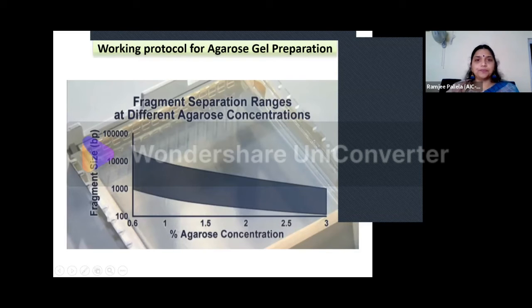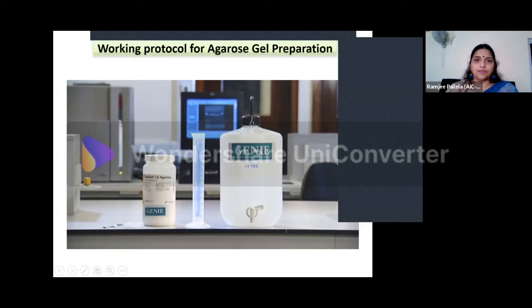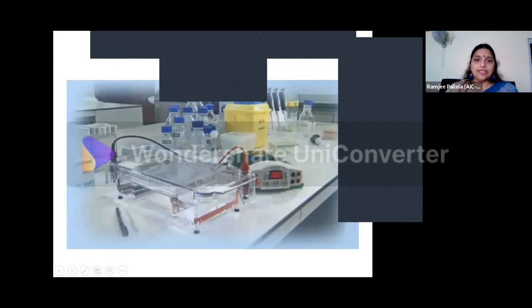Percentage of agarose. There are two basic components to an agarose gel: the agarose, which is a white powder, and a buffer solution. These need to be heated together to make the gel. This is how the apparatus looks.